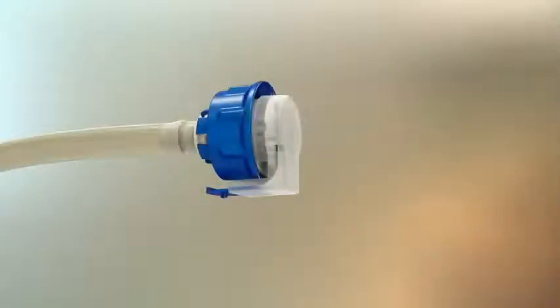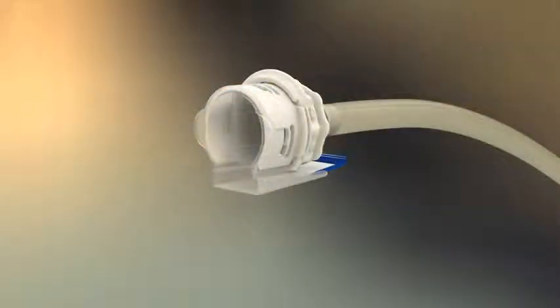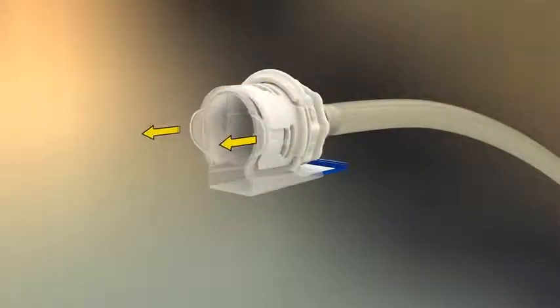The protective cap on the male insert is removed by lifting the bottom tab. The protective cap on the female body is removed by squeezing and pulling the side tabs.